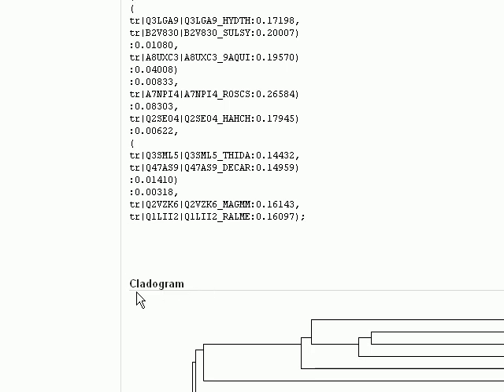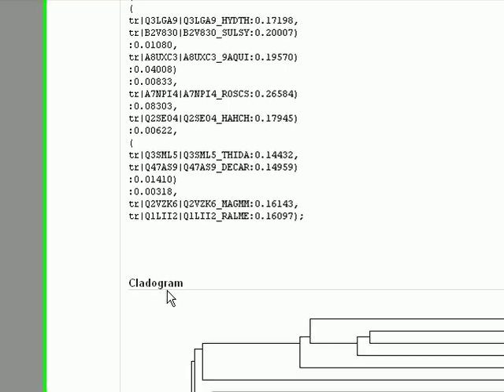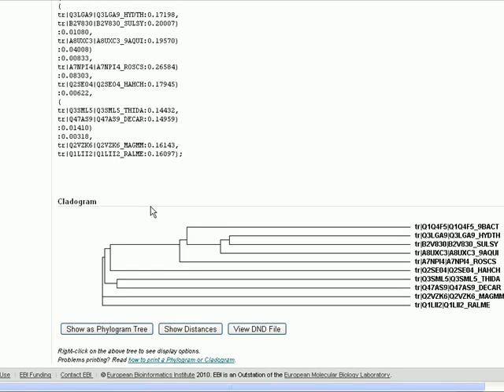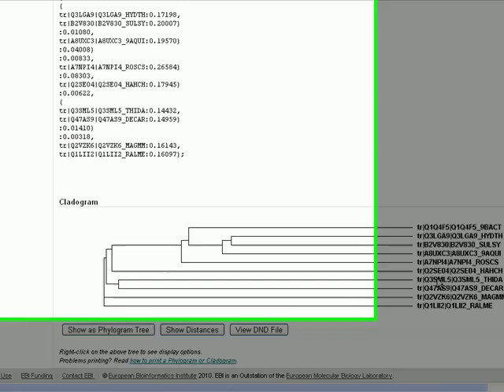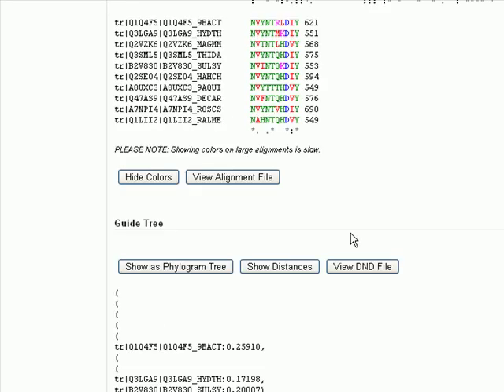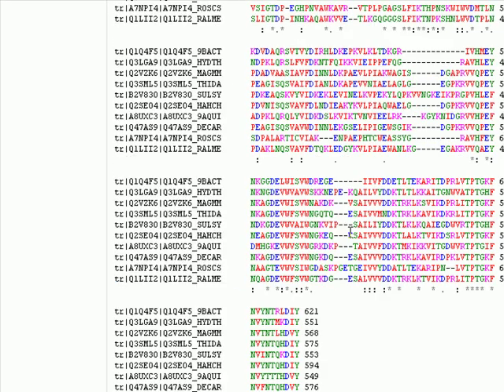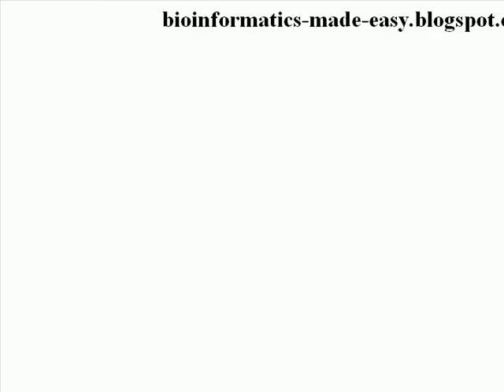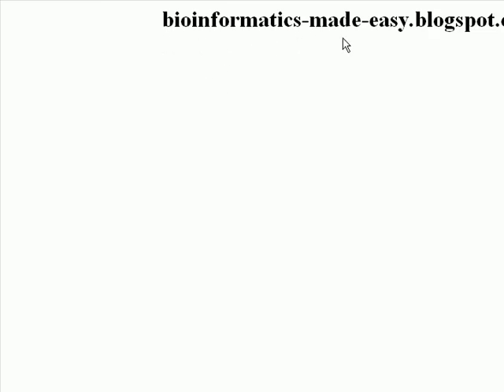And this is the dendogram for our ten sequences. Okay, that's it for today. For more information about bioinformatics and bioinformatics tutorials, please visit my blog at bioinformatics-made-easy.blogspot.com. Thank you for listening.